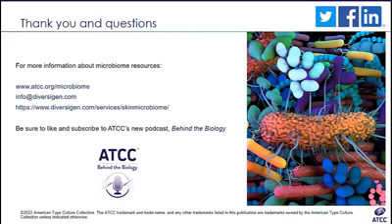Okay. And here's a very technical question. Do you have to do amplification for whole genome shotgun, or do you just sequence to greater depth? Can you repeat the first part? I'm sorry, I think I didn't get it. Sure. Do you have to do amp, which I think is short for amplification in this context, for the whole genome shotgun, or do you just sequence to greater depth?